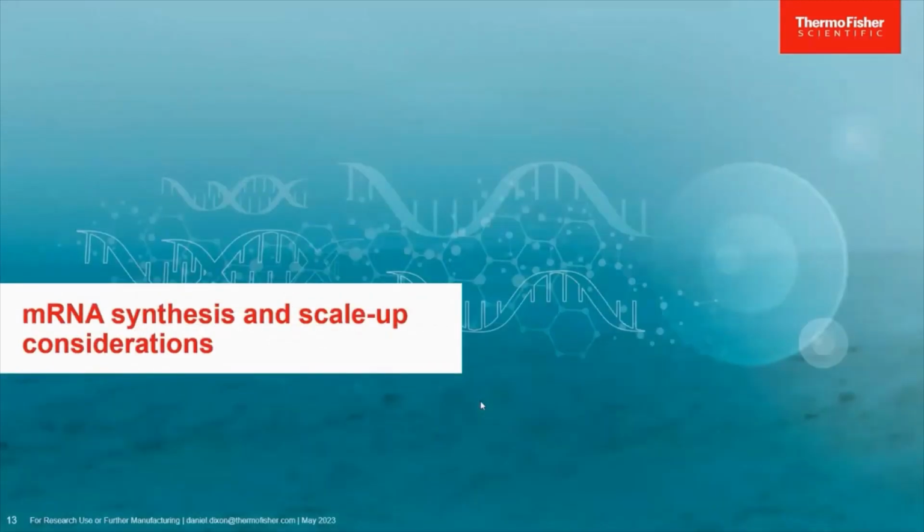And now that we have a foundation into the critical material aspects for IVT, let's shift into some process development work that was recently done to optimize IVT process parameters. That way you will gain information on how to improve your IVT from both a quality and now process perspective.